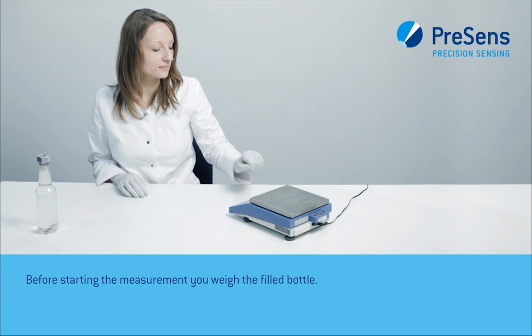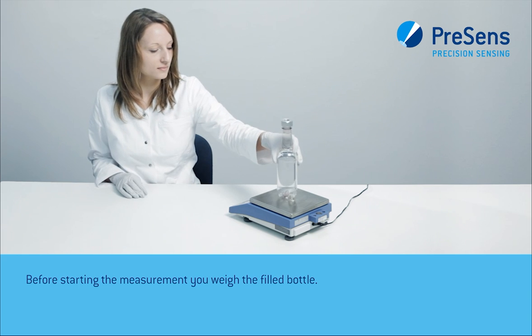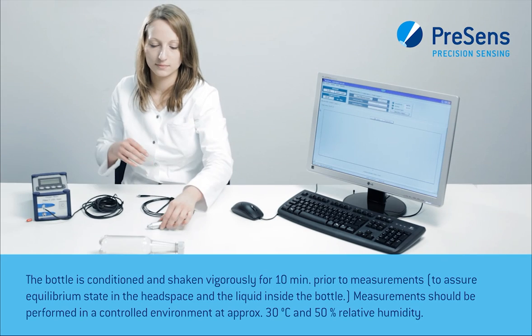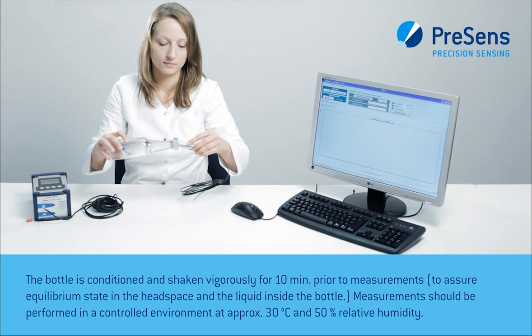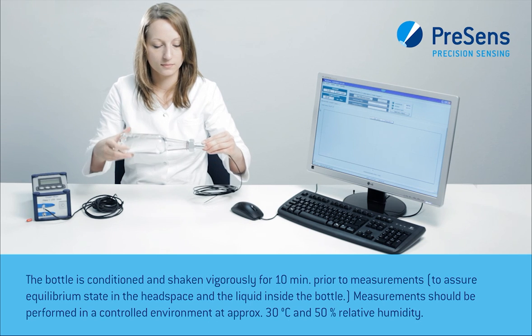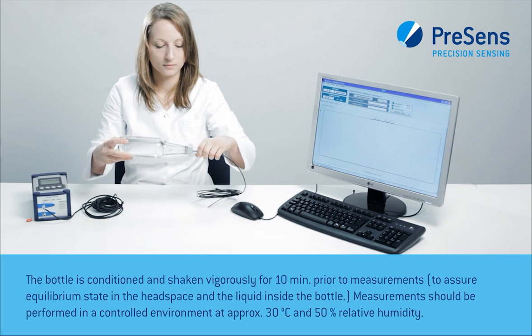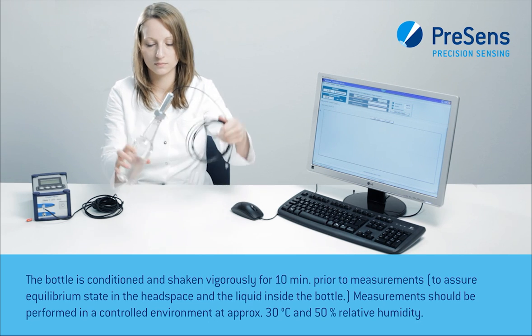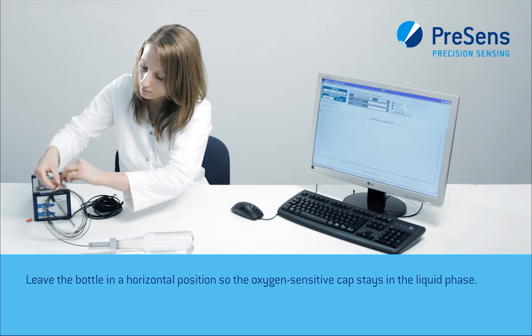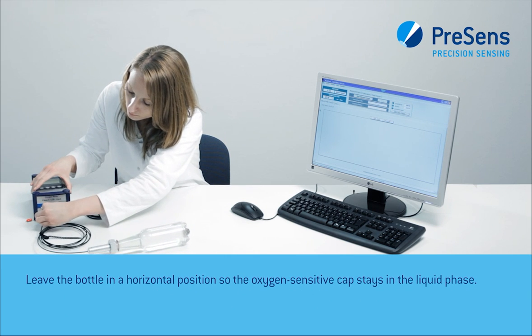Before starting the measurement, you weigh the filled bottle. The bottle is conditioned and shaken vigorously for 10 minutes prior to measurements. Measurements should be performed in a controlled environment at approximately 30 degrees Celsius and 50% relative humidity. Leave the bottle in a horizontal position so the oxygen-sensitive cap stays in the liquid phase.